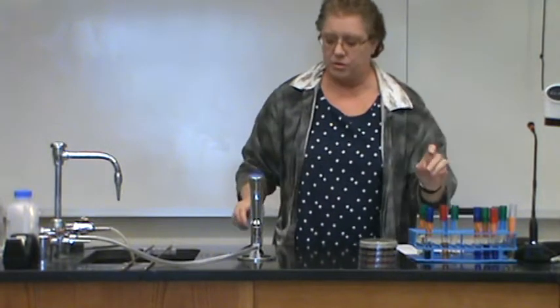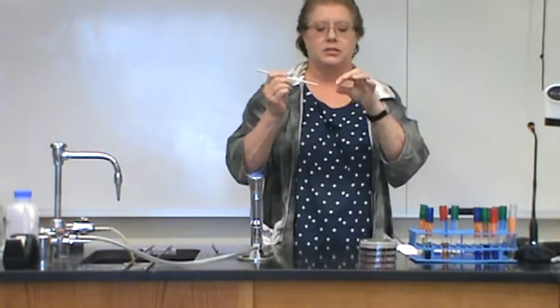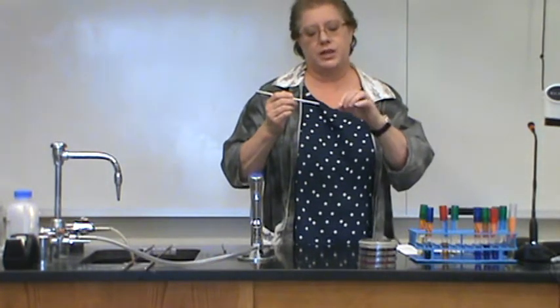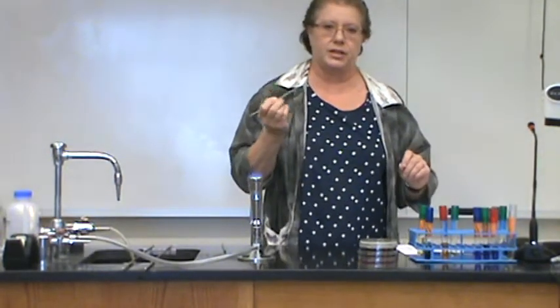All right, so you are going to use a different piece of equipment. It's called an inoculating needle. This is a lot like your inoculating loop, except it doesn't have a loop on it. It's a needle. You don't ever put a loop on it. When you're provided with a needle, it's supposed to be a needle. So you want to make sure it's as straight as you can get it. And you're going to be inoculating the SIM media using what's called a stab technique with an inoculating needle.